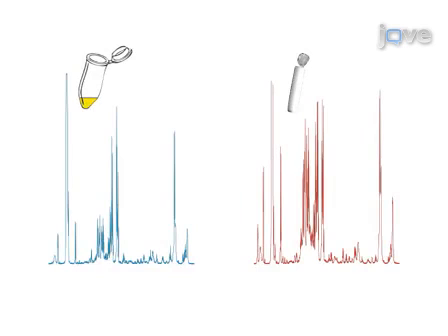Ultimately, this use of proton NMR spectroscopy reveals various metabolites involved in metabolic pathways such as energy and oxidative stress pathways. So this experiment can provide insight into the liver functions during colonization. It can also be applied to other systems such as kidney.